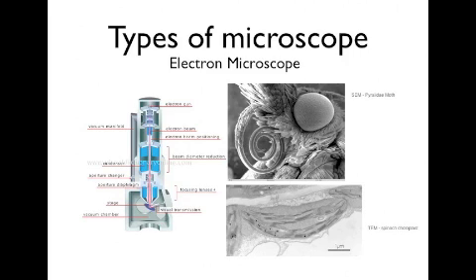One of them is SEM, which is the first picture. It's a scanning electron image. It provides much more detailed imaging. In this case, we have a Pyralidae moth, which is a butterfly. As you can see, it's pretty detailed.